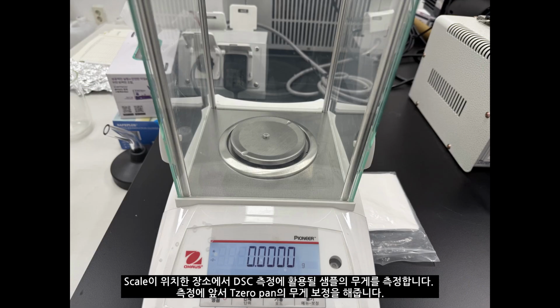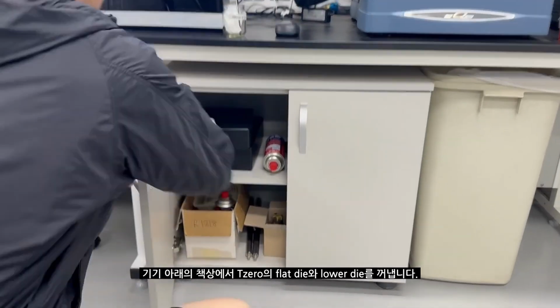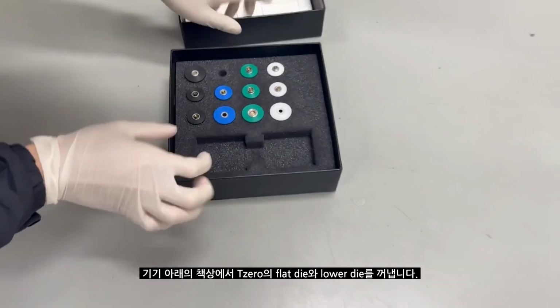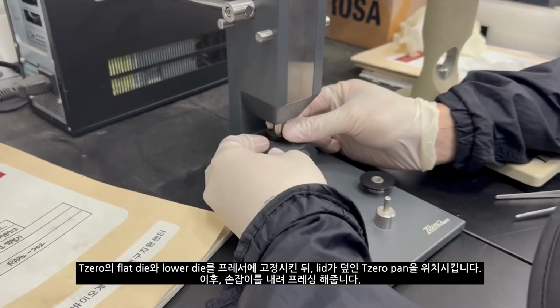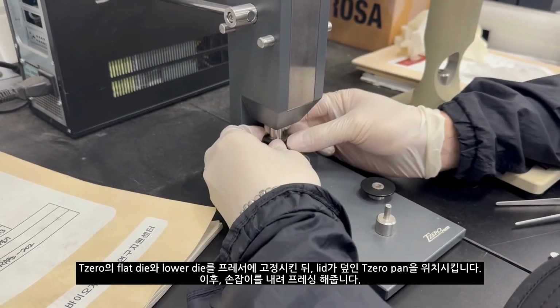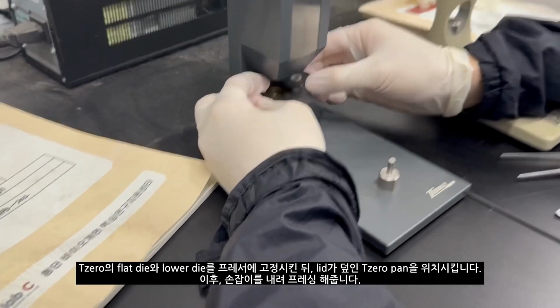Tare the T0 pan before measurement. Weigh the sample on the T0 pan. Take out T0 pan flat die and lower die from bottom of the desk. Insert both flat die and lower die into the presser and place T0 pan with lid closed. Afterward, move the handle to press T0 pan.